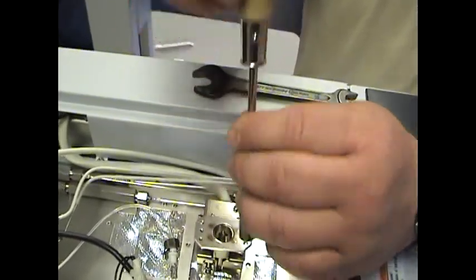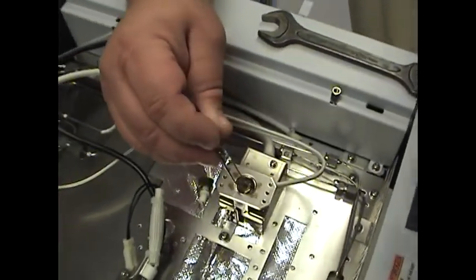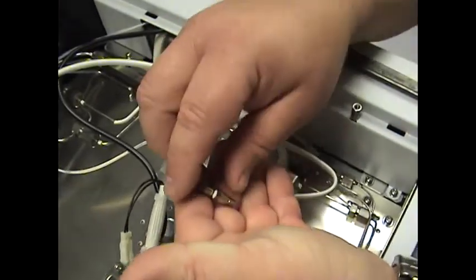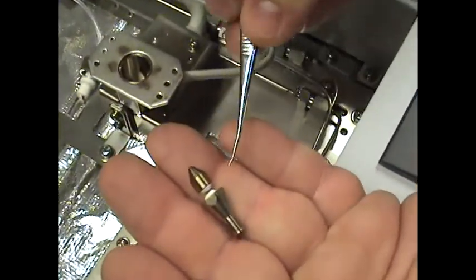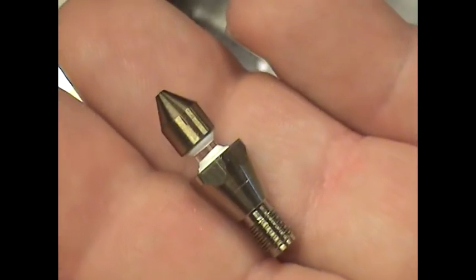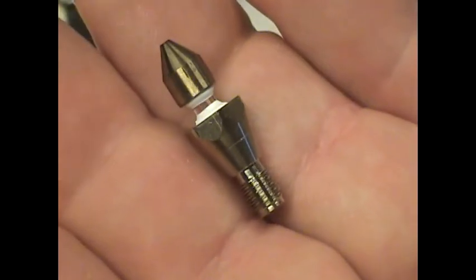I'm going to show you why. Unscrew it, take a pair of tweezers, and grab that jet. This portion right here is quartz in between the two white ceramic parts. That can crack very easily if you torque this tool back and forth too much.